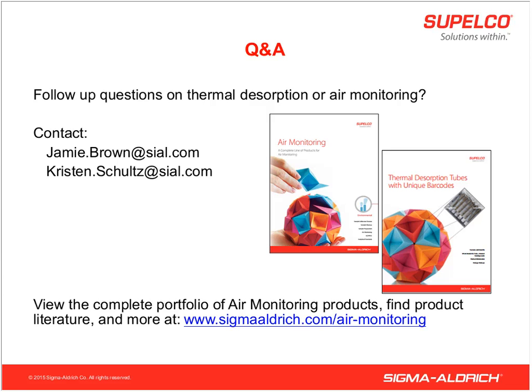Here's a question from Vincent. Please address trap selection for the thermal desorber.